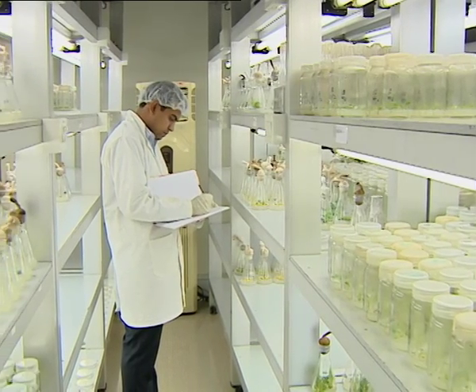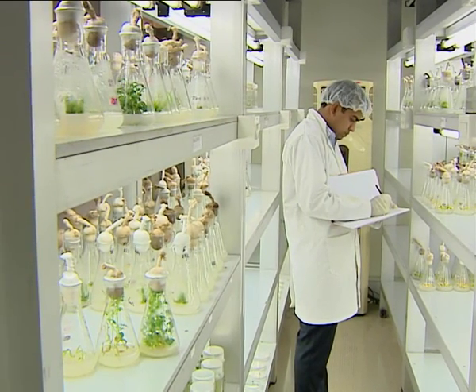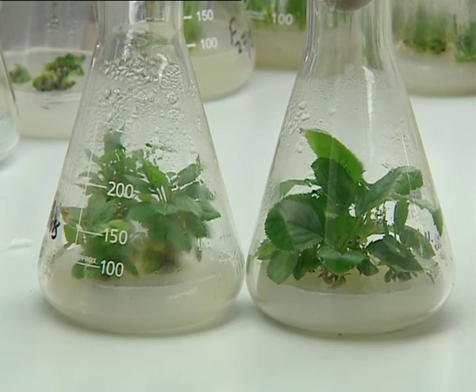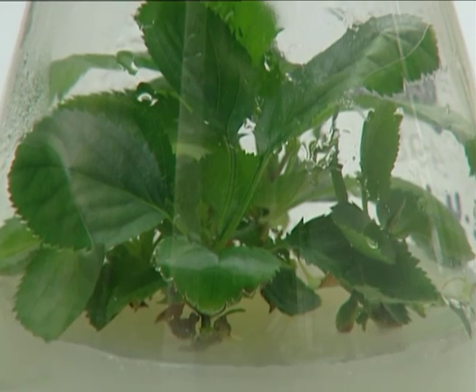Plant tissue culture is a collection of techniques used to maintain or grow plant cells, tissues or organs under sterile conditions on a nutrient culture medium of known composition.